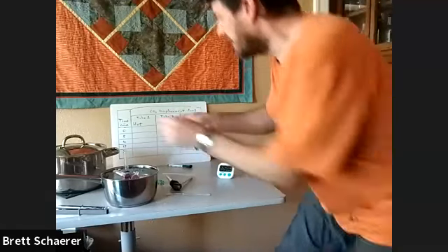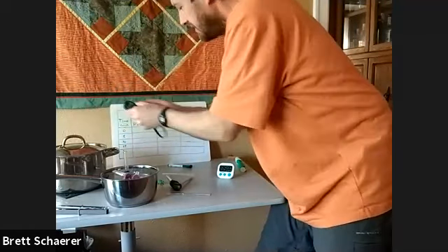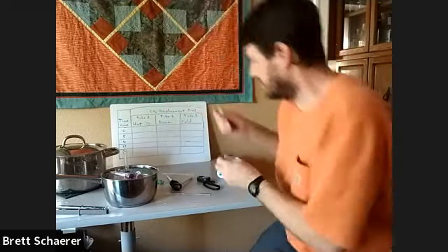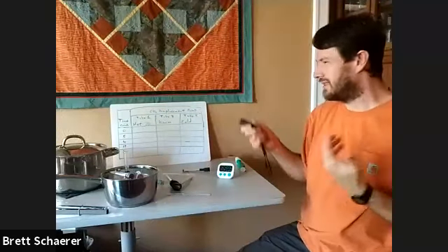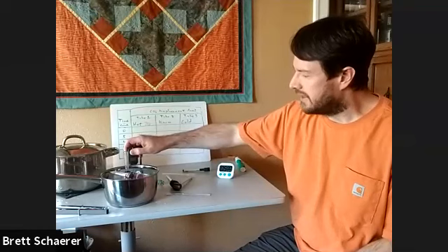We're going to start with the hot environment. And the water in there is 70 degrees. So it might change a little bit over the course of the experiment, but we'll take a reading now and another one at the end. And we can say it's at least in that range.